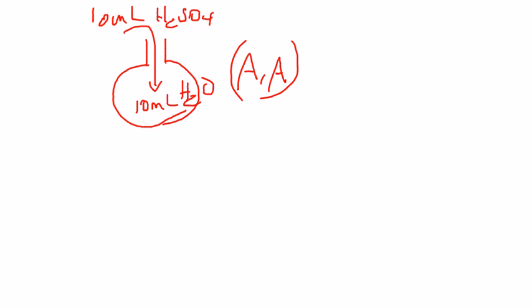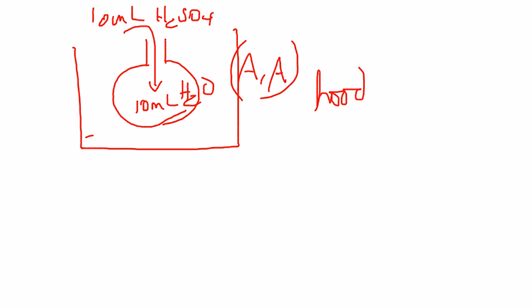because water has a really high specific heat, and so it's a safety measure, it's a safety feature. If I were you, like I said, I would do that in the hood. So do it in the hood. And also try to cool it down in ice. The reason why you want to do that is because this reaction is exothermic in nature due to the formation of the hydronium ion.